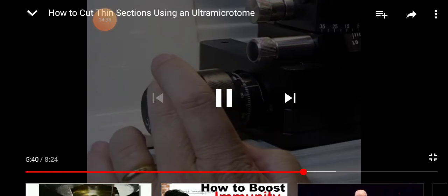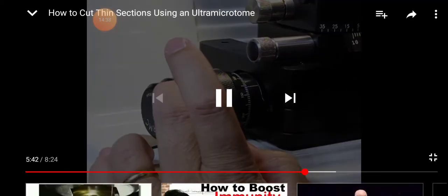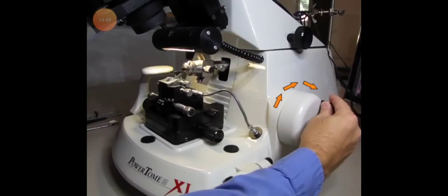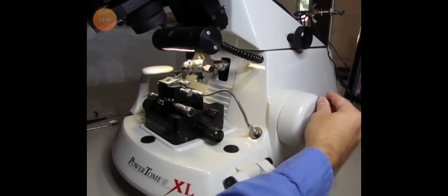Micrometer to adjust. Move it closer. Pass through again. Remember to take a clockwise pass of the flywheel. This is manual operation. So now we're really close. You can see that the object holder is moving just up and down to take a section, and this knife is kept stationary. So now you saw the knife. It's so close here that really the knife is very small.